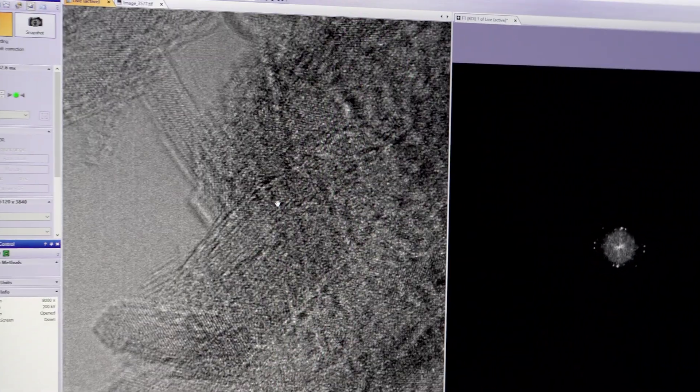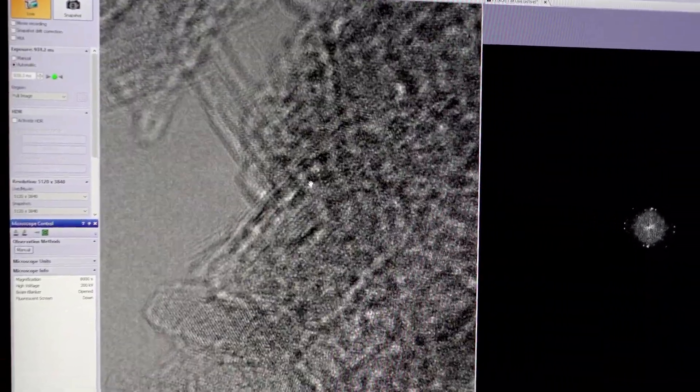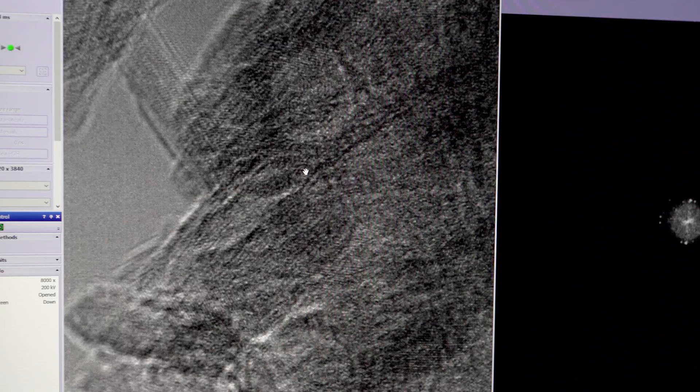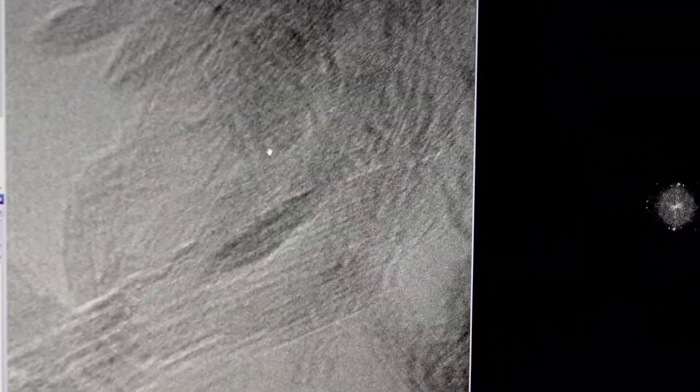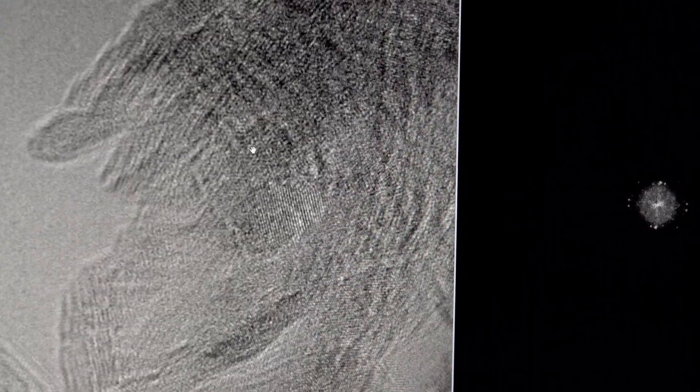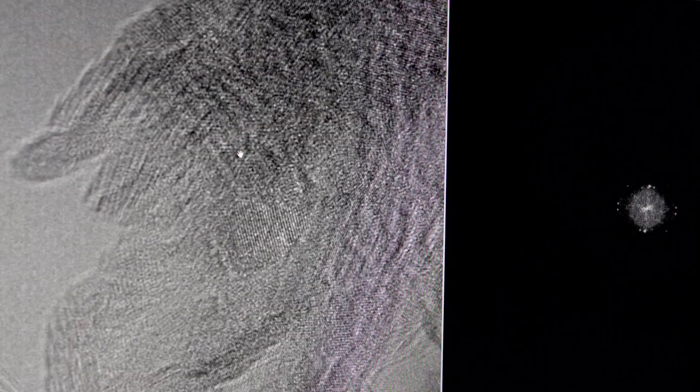We are trying to understand what sort of arrangement of planes you have here. So these fringes that you see are atomic planes, and by understanding with different elemental doping and concentrations how the structure changes and thereby how the properties of a material are affected.